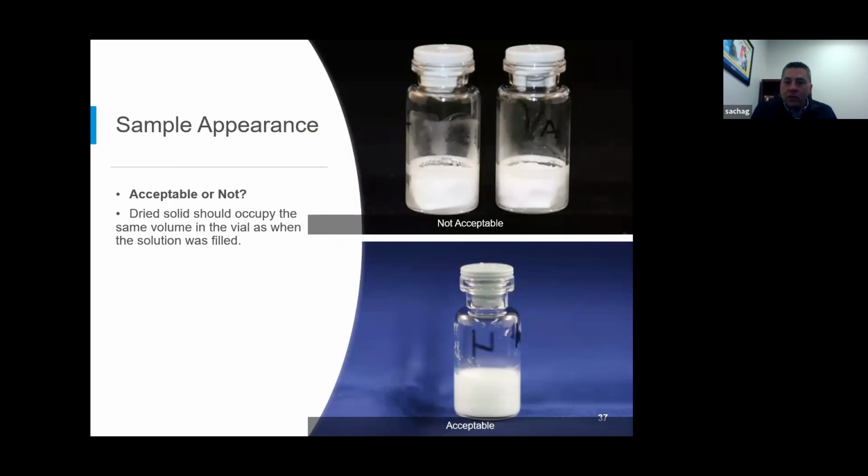We're also concerned about, in your experience, how comparable is the lyophilization behavior of the ADC to behavior of the drug-free mAb? They're pretty much comparable because the monoclonal antibody itself, let's say, is about 150 kilodaltons. The ADC is very close to that. That linker system and the small molecule that's attached, they don't add much more weight. So they're very, very close.